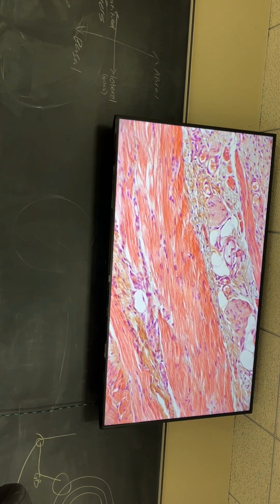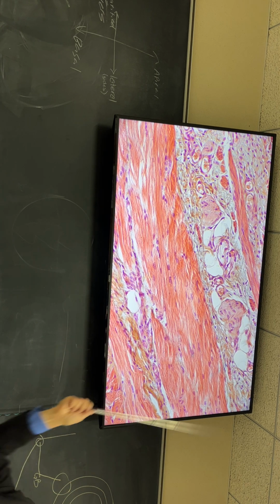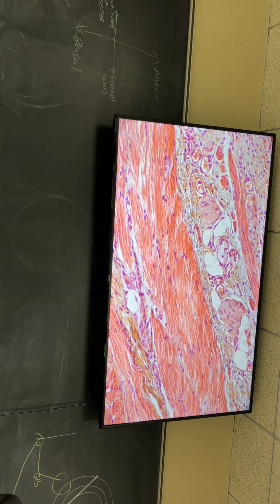What about this? Ooh, that's cool. I like that. All right, let's look at this. What is that? Is that nervous tissue? Nerve receptor. Nerve bundle there, nerve bundle there, right? Nerve plexus, if you will, right? Gotta have nerve control to control those muscles, right?